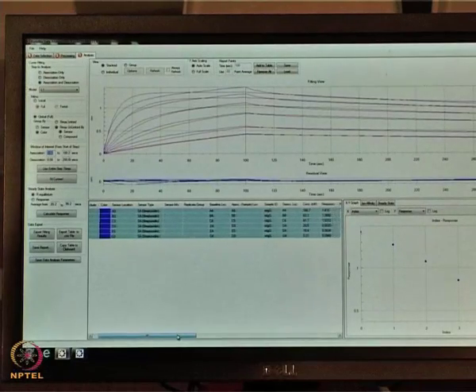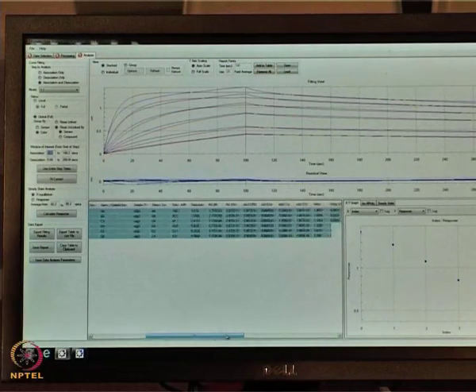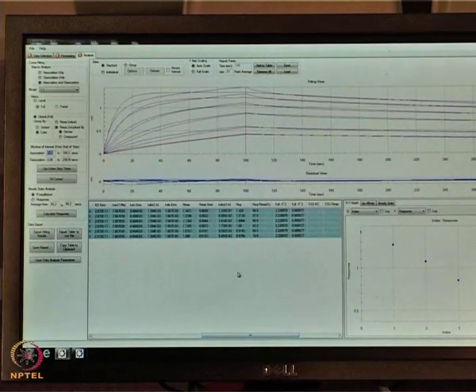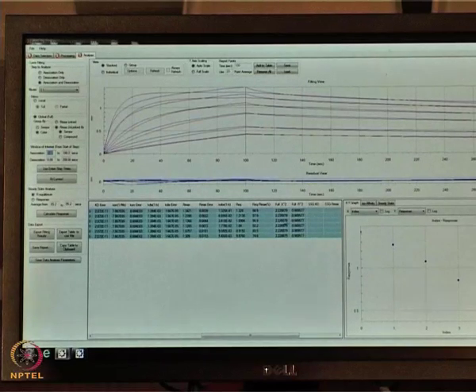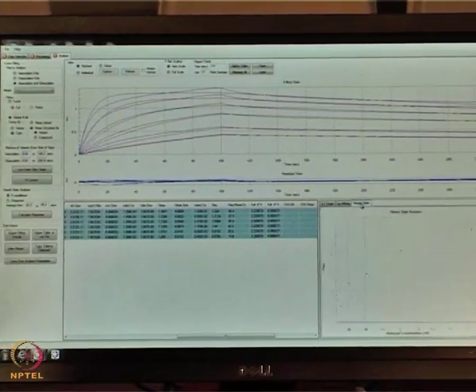Easily we can see the good fits with respect to the chi-square values as well as the R-square values. If you look at this table, we have the Kd errors, the Kon with the Kon errors. In case of kinetics, a good fit is when R-square is 0.95 above, and chi-square should be less than 3. This indicates that it behaves as a 1:1 binding model, supported by your R-square as well as the chi-square statistical parameters. Also we have graphs like the XY graph, iso-affinity graphs, as well as the steady state.